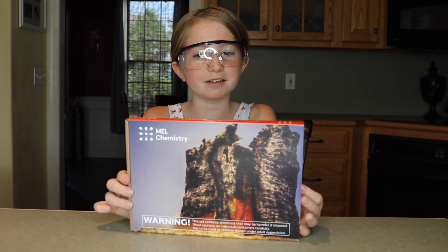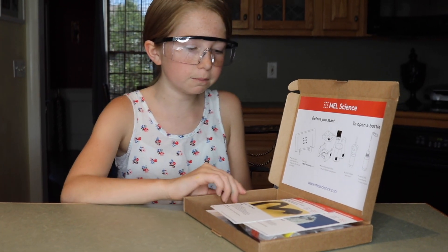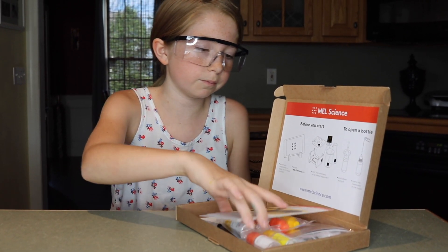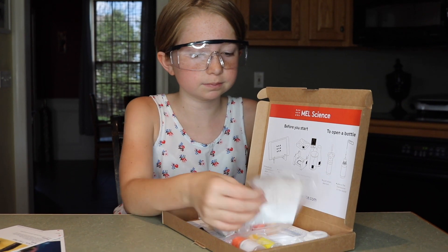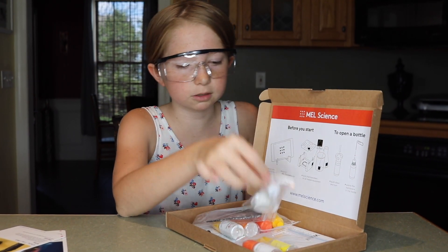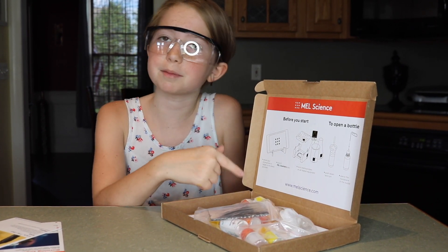Next, we're doing the chemistry of monsters kit. Let's see what's inside. When you open this one, you have the choices to do a sugar snake or burning sugar. There are three different packs of chemicals, some tin foil, a spoon and a little cap, a stick, and then just some instructions.